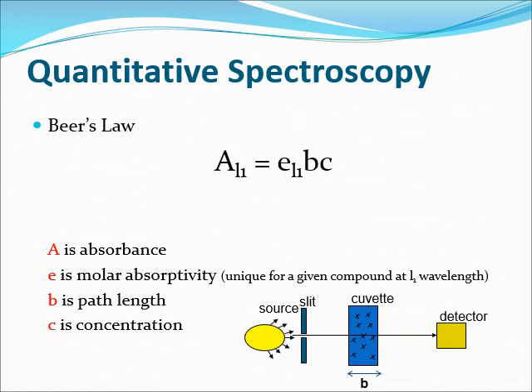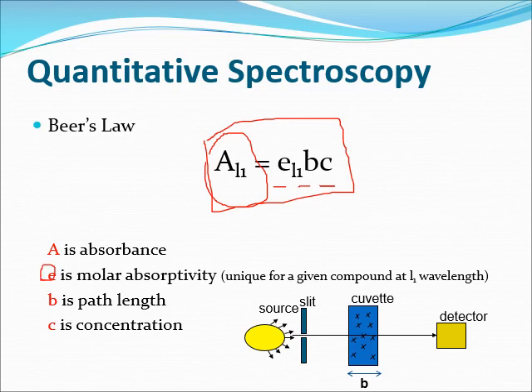Alright, so this is Beer's law. This is the formula to calculate the absorbance value that comes up from the machine. The formula is A = E times B times C. So what is E? It is the molar absorptivity, the tendency of the compound inside your samples to absorb the wavelength. B is the path length of your cuvette, from right to left, the length of your cuvette, and C is the concentration of your X compound in your samples. This X here refers to the X compound.